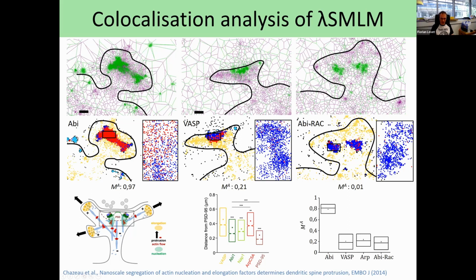And here you can see that we applied it on some data from our collaborators. I already published this data in a previous paper, but in that case, they used reconstructed super resolution images in order to do the analysis, with a pretty complicated workflow. In this case, I only applied a threshold of 1 times the average density. I clicked on the button, it did all the analysis, and then I just needed to put everything in the same plot.